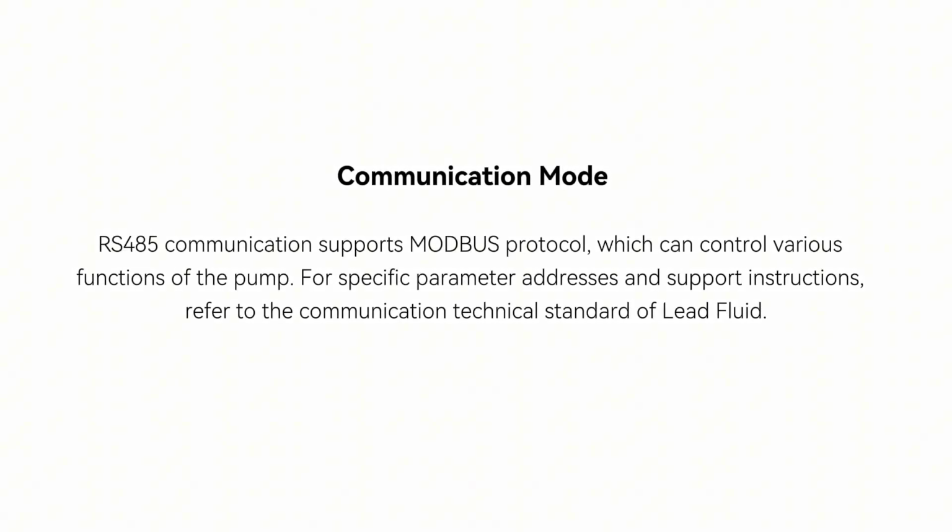Communication mode. RS485 communication supports Modbus protocol, which can control various functions of the pump. For specific parameter addresses and support instructions, refer to the communication technical standard of Lead Fluid.